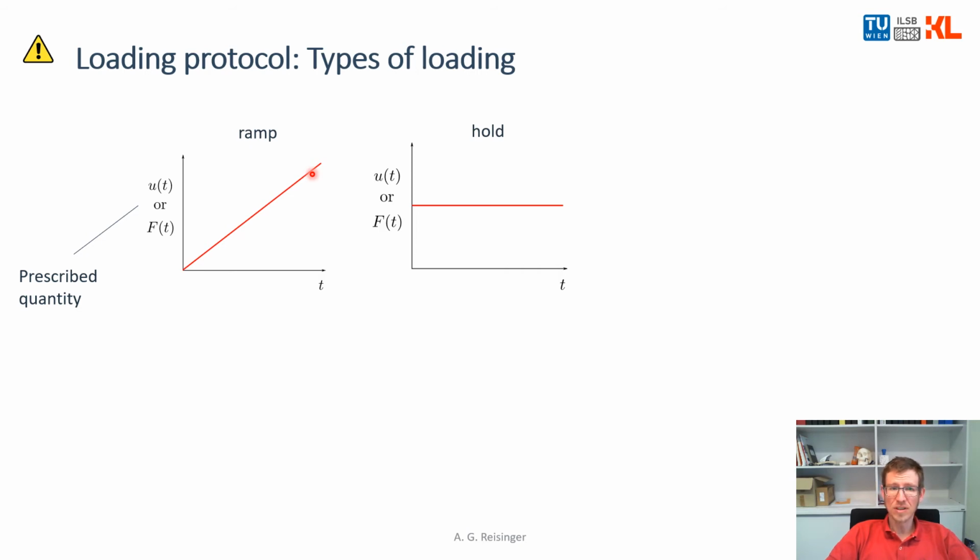So you tell the machine, please hold the displacement. Yeah. If you would like to track, for example, the force response when the sample is relaxing, then when you hold the displacement, the force is dropping because the sample is relaxing.